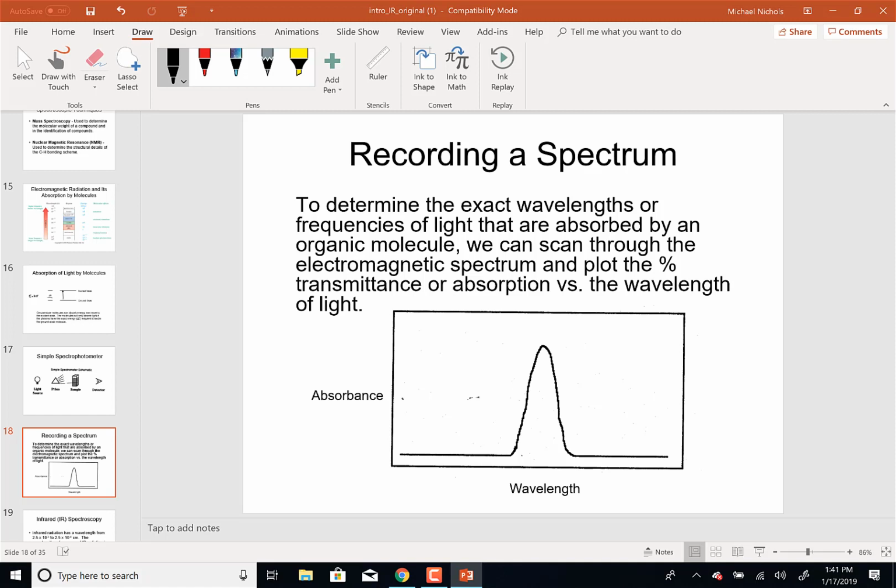What you worked with in general chemistry, or analytical if you did any visible spectrometry in analytical, was the intensity of the light at one particular wavelength, right? Because you prepare a Beer's law plot where you plot concentration versus intensity and you get a straight line.